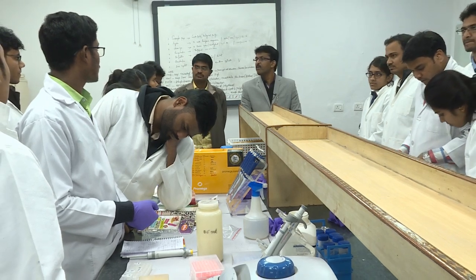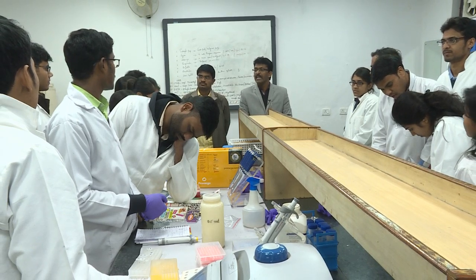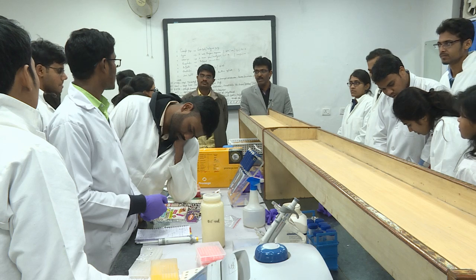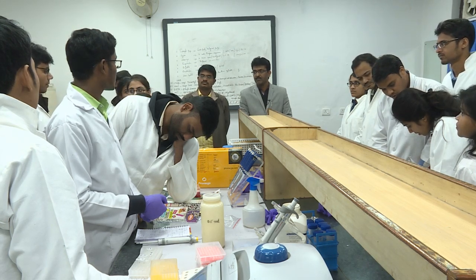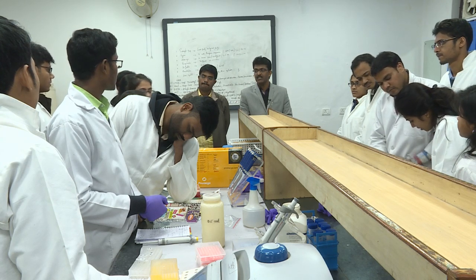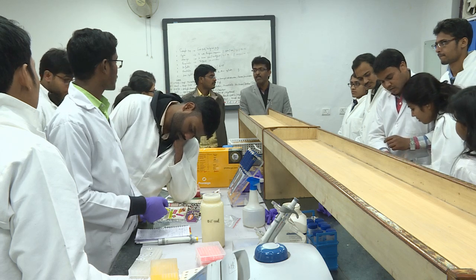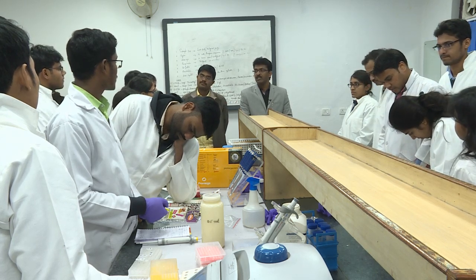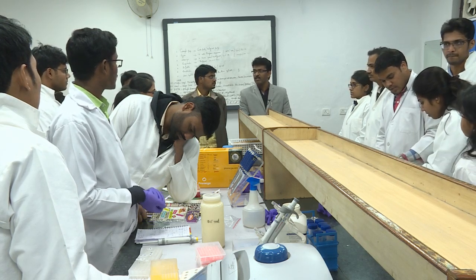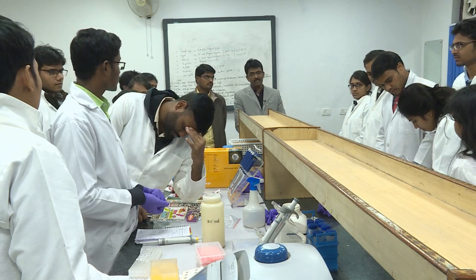You can set up maybe the 16S and the housekeeping gene of Ralstonia together, and ITS for Sclerotium can go to Dr. Deepa's lab. The Magnaporthe specific gene also has the same conditions as ITS, right? So that means Magnaporthe and Sclerotium will go to the same machine, and Pseudomonas and Ralstonia will go to a machine, and the Bacillus is already going on in this lab. Okay, that's great.